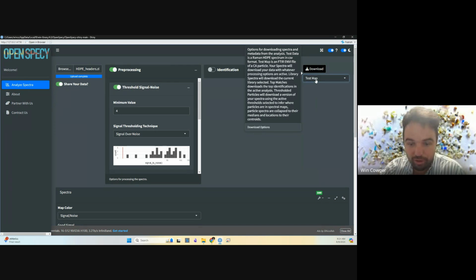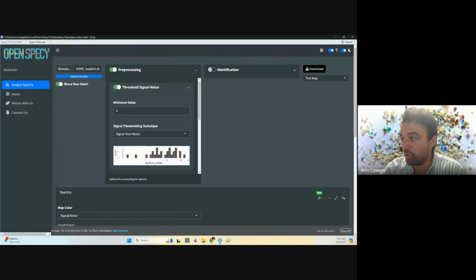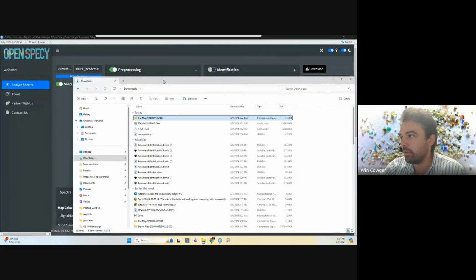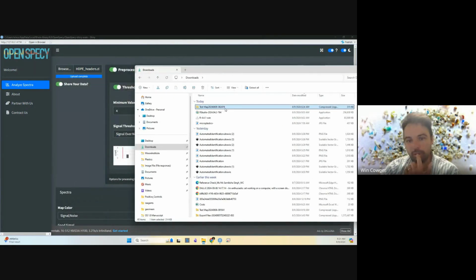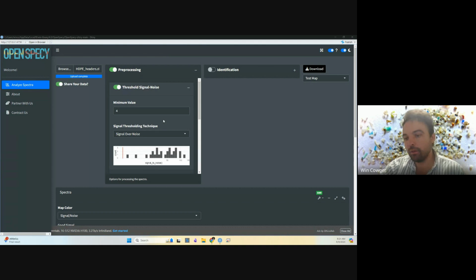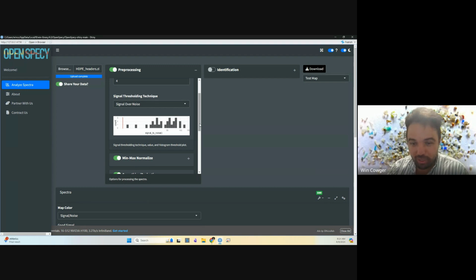You could download the test map and then upload that, because that really should work. If that's not working, that would surprise me. The test map is also a batch analysis that you can download and upload over here. Sorry about that. Just to check, is everybody having this issue right now, or are some people able to keep going?